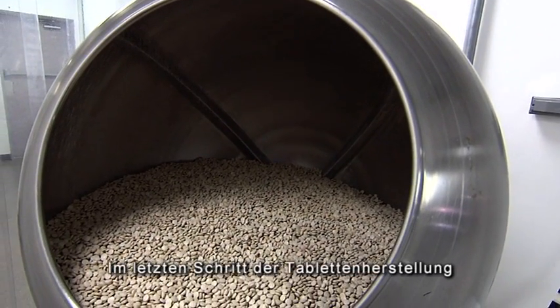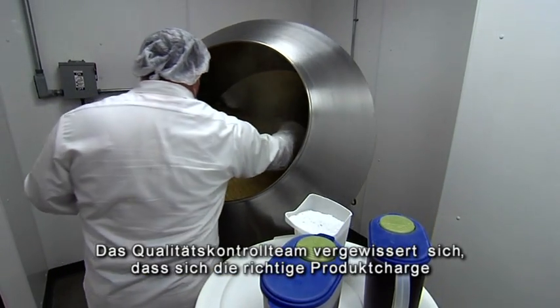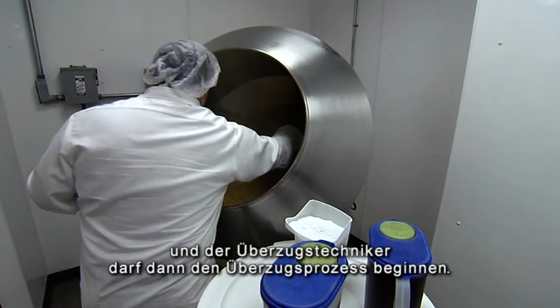The final step in the tableting process is to load the tablet cores into the coating pan. Quality control will come in, check and verify that the appropriate lot of material is in the coating pan, and the coating operator is then released to go ahead and begin the coating process.